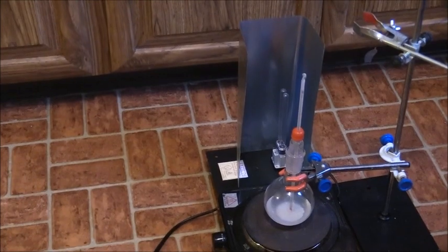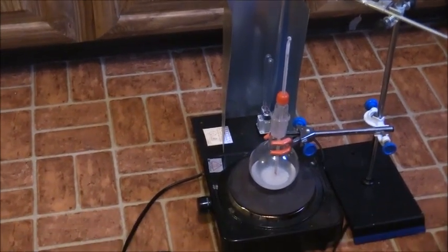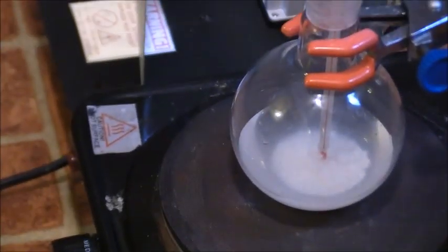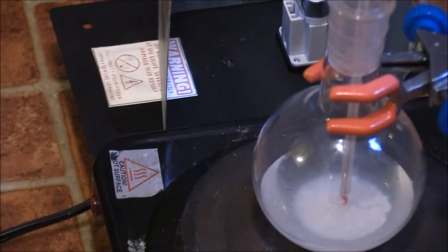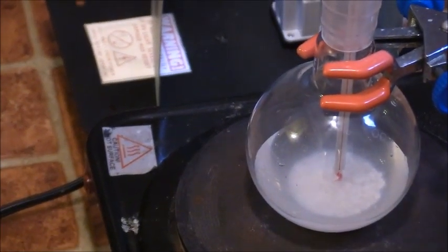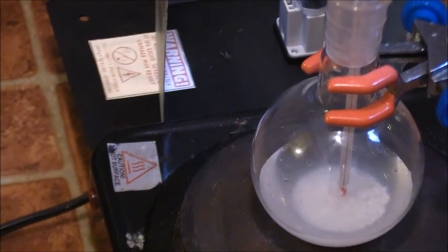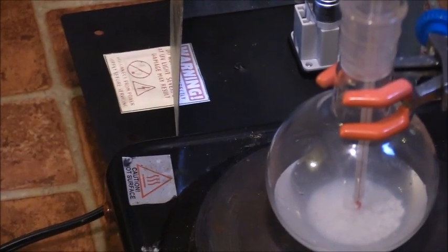What I have here is a solution of formamide, 60 milliliters of formamide, along with 2.4 grams of sodium pyrophosphate and 2.4 grams of calcium carbonate. 2.4 grams is actually 4% as per the original experiment.